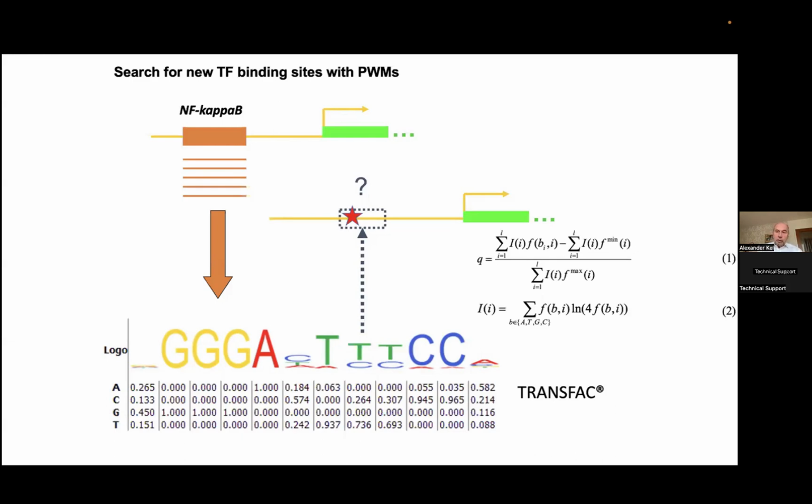But in the majority of cases we still don't know whether those known mutations are simply not observed, or there are other mutations in the genome which are not really affecting proteins, but are affecting cancer growth. They may become the driver mutations, actually mutations which are located in the regulatory regions of genes. And those are the mutations we are going to analyze using TRANSFAC.